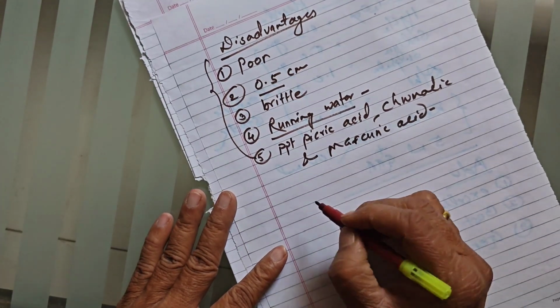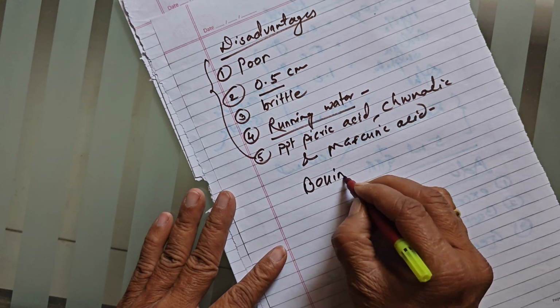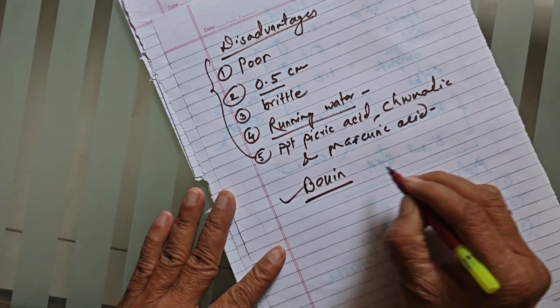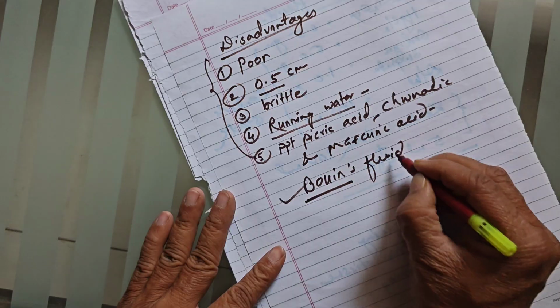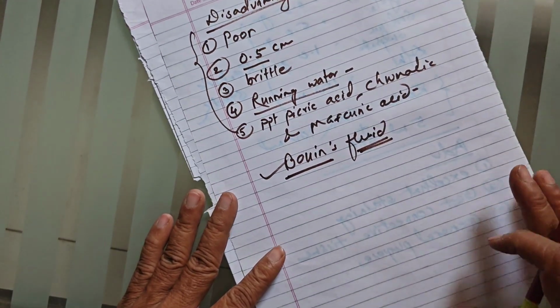So we are recommending that Bouin's fluid is an excellent fixative in our laboratory. So we are using this Bouin's fluid for fixation. Okay friends, now we will stop here.